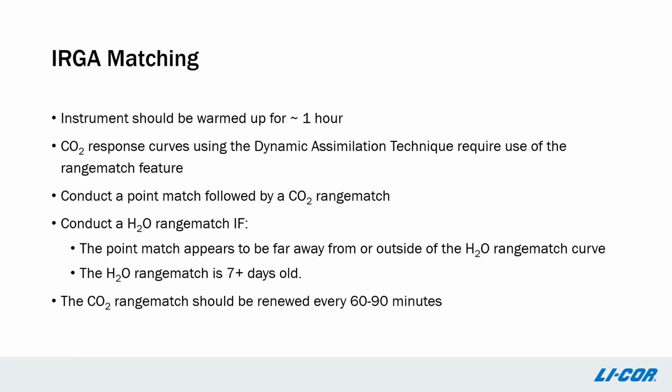We recommend a water vapor range match if the point match appears to be outside of the current water vapor range match curve, or if the water vapor range match is more than 7 days old. We also recommend conducting a new CO2 range match every 60 to 90 minutes or so when running dynamic assimilation CO2 response curves.